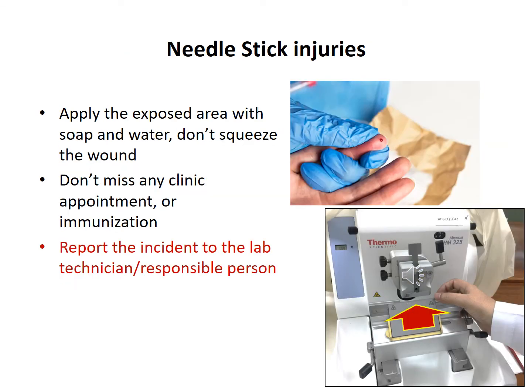So in some of the labs, not all labs, for example in medicine or the hospital, those people are working with the human side. So they need to play with needles. So needle stick injury is also very common, okay? And of course, when an injury happens, wash this particular area and don't squeeze the wound, okay? And don't miss any clinic appointment or immunization. Usually the people who are working in the hospital have already got the immunization, but even then you have to be very careful and report the incidents to the lab supervisors, okay?